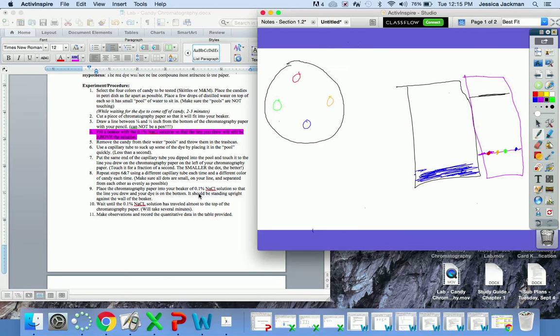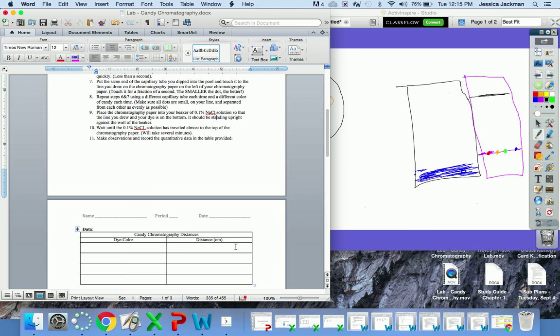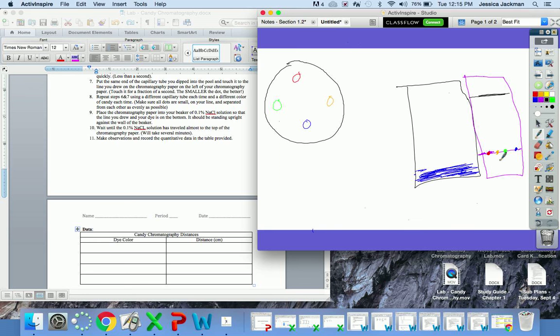When you take it out of the solution, you're going to make observations and record the quantitative data in the table provided. Once it's all done and it's not sucking up any more solution, you're going to take this paper out, and let's say this red one's moved to here, this green one moved to here, the blue one's like here, and the orange one's still just like there. You're going to find the center of the dot, of the splotch, of each color.